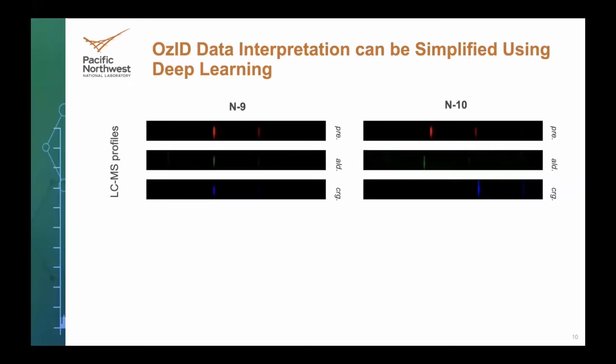For one double bond position, we're comparing LCMS profiles, that is two-dimensional data that consists of a mass spectral component in the X dimension here, and retention time components in the Y dimension, similar to what Yvette was showing earlier, right? So we're comparing these profiles for the precursor and a pair of putative fragments that are diagnostic for one position. And when we evaluate different positions, we're basically just comparing different sets of these 3 LCMS profiles.